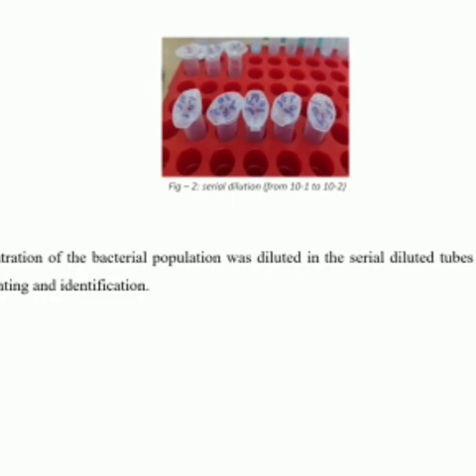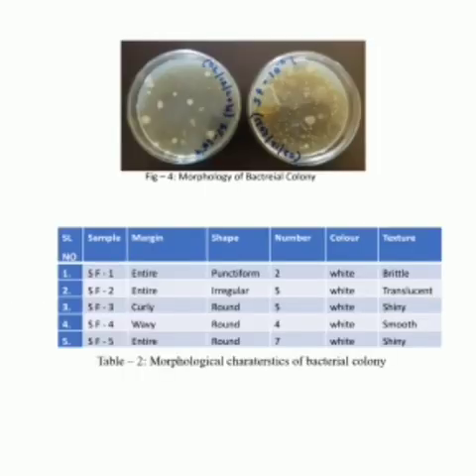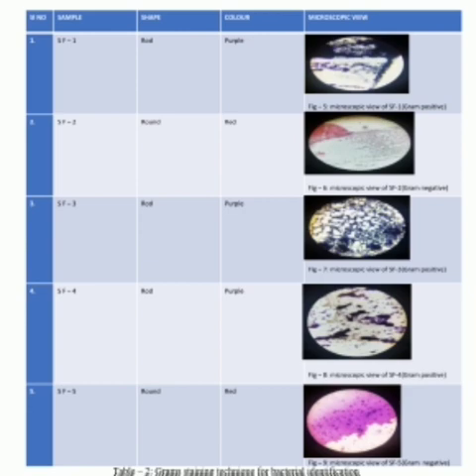In rough culture, we obtained 5 different bacterial colonies. Then we went for subculturing to get pure colonies. Then gram staining was used to identify bacteria. It is a technique used to determine the gram positive and gram negative bacteria in our work.